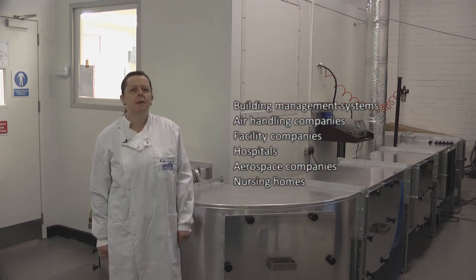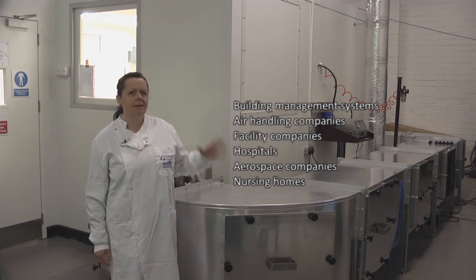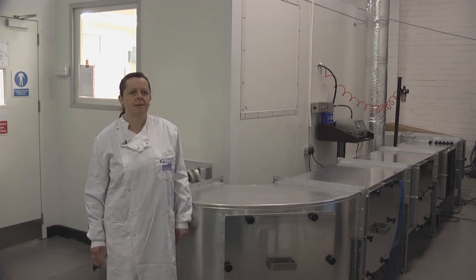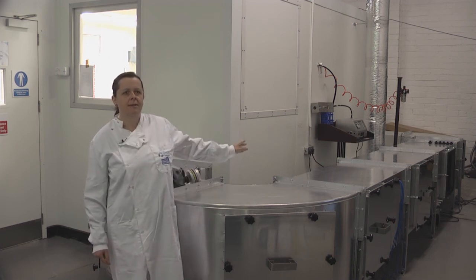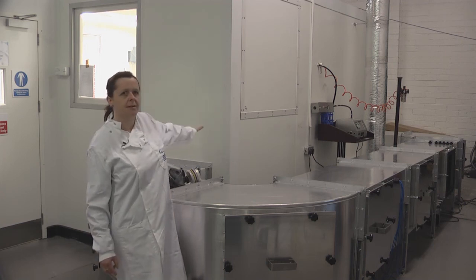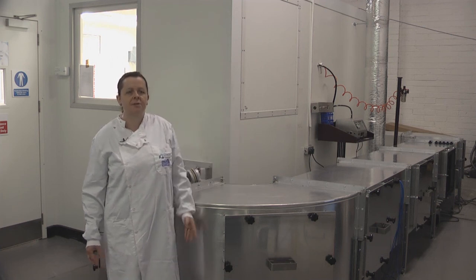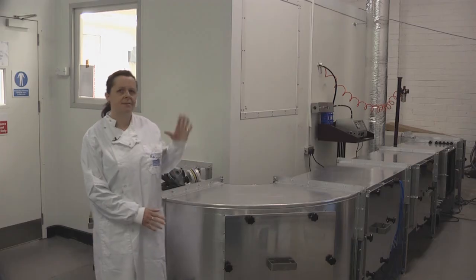I think this would be particularly important for industries that are targeting hospitals, nursing homes, large office complexes, and department stores for controlling microorganisms circulating in their HVAC duct systems. They would definitely get ahead of the market if they're able to say that their product effectively works in the HVAC system and also in the rooms connected to it — that the microorganisms aren't circulated around but are destroyed in the duct.